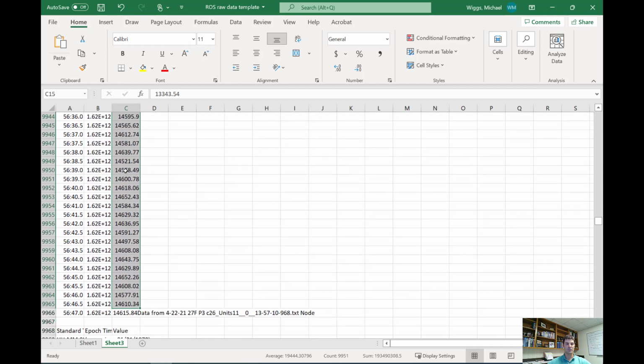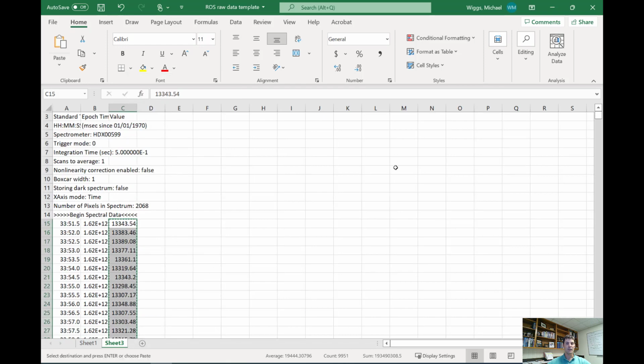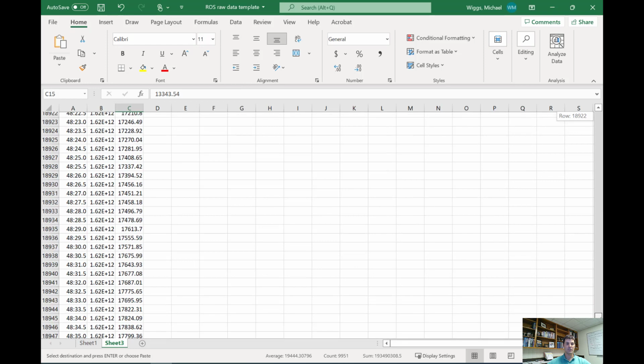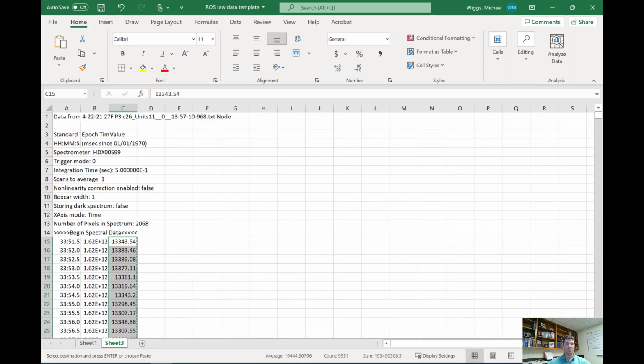So once we get those selected, again, you can copy them as you go through. One of the quick things I'll note, so there's a duplicate copy, there's a top and a bottom. I'm moving really fast so you can't really see that. The data should be the same. Not all data files will have it. Typically, if you autosave with the program, it'll create 2 files. If you save it as a text file, it won't. So either way, the data looks exactly the same.